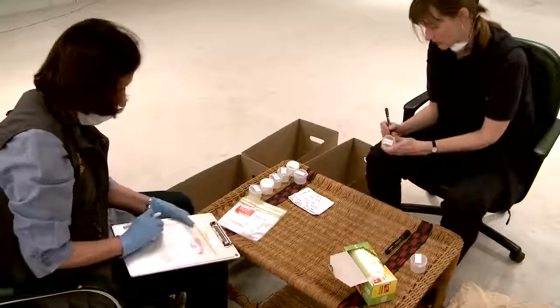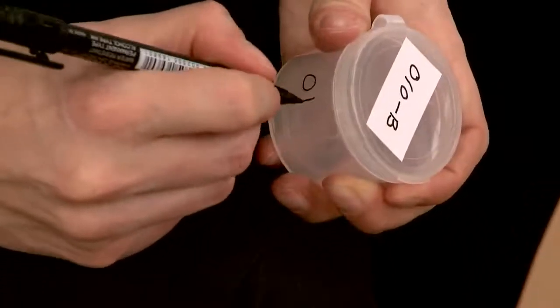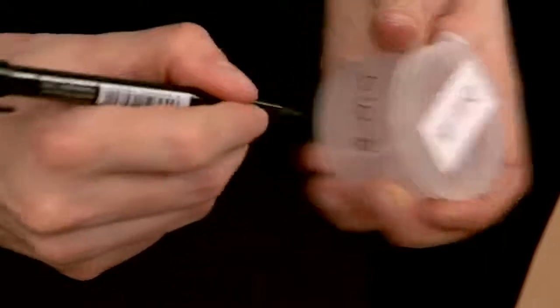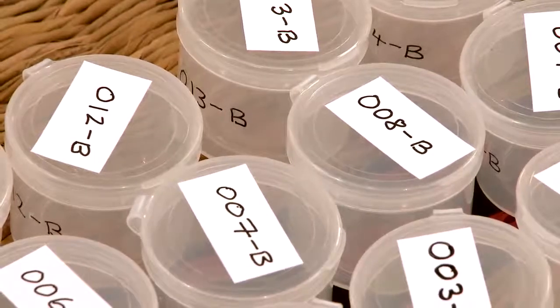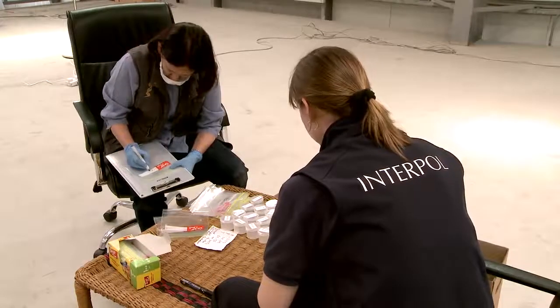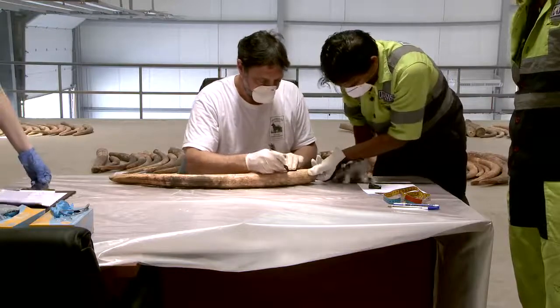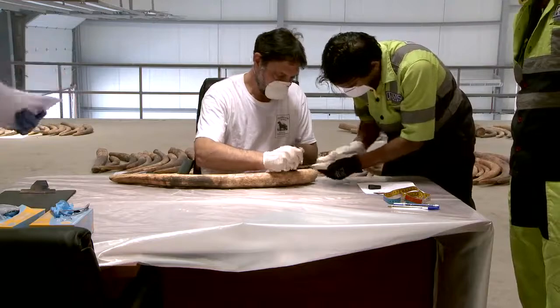For each of the selected tusks or ivory pieces, label a container by writing the group letter and tusk number using a permanent marker. If the container is a vial, write the group letter and tusk number on both the side and the lid. It's useful to cut a piece of cardboard 3 centimeters by 3 centimeters to use as a template. Make sure that the cardboard template can fit in the labelled containers to ensure that the ivory pieces you eventually cut will also fit.